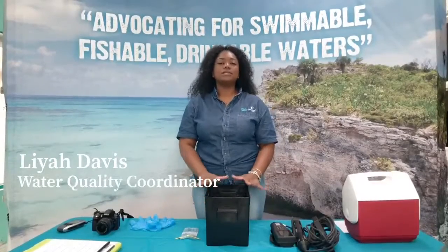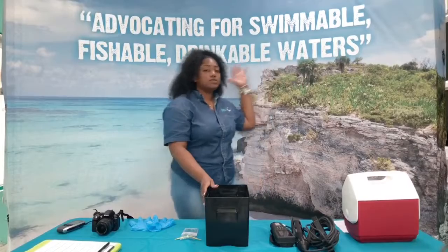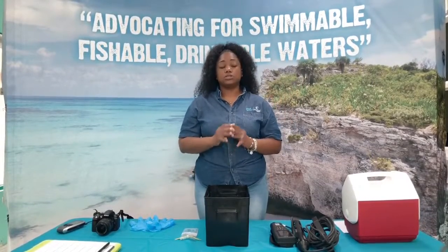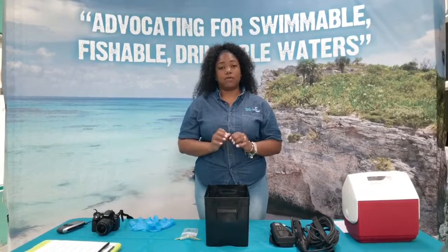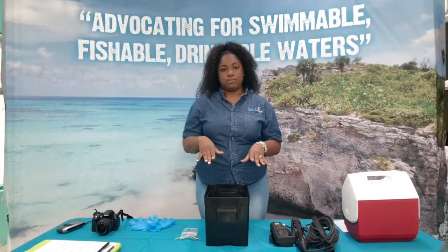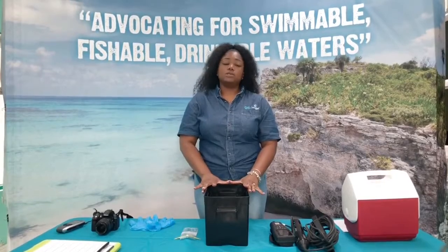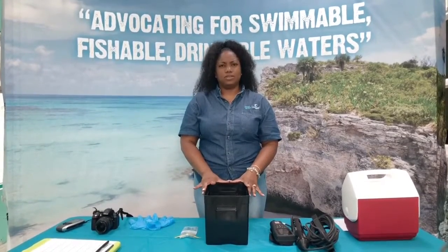The Water Quality Coordinator here at Waterkeepers Bahamas, where we advocate for swimmable, fishable, and drinkable water. Here at Waterkeepers Bahamas, we monitor 22 beaches between the islands of Grand Bahama, New Providence, and Bimini. We also monitor 28 personal wells on the island of Grand Bahama. During World Water Monitoring Day, we will show you the procedure for our water quality monitoring.